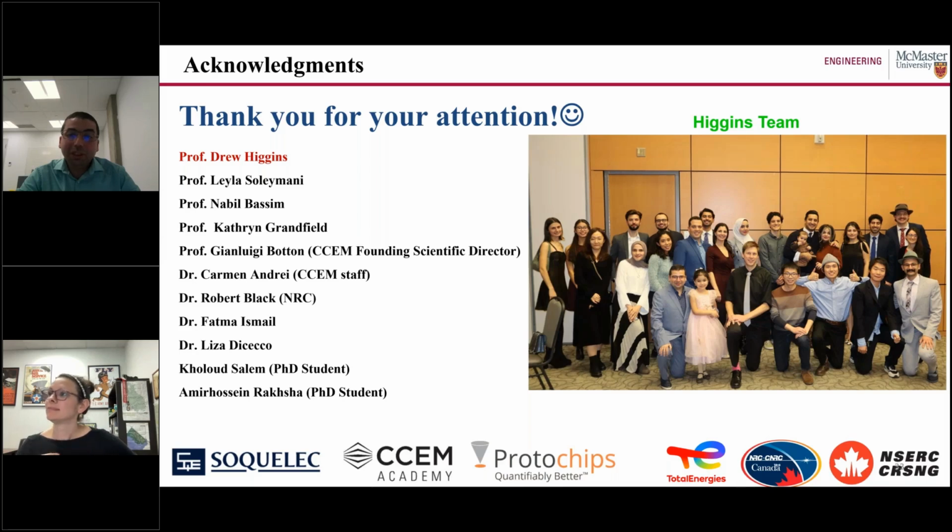The first main reason is just to keep our solution saturated with carbon dioxide all the time during this measurement, because the solubility of carbon dioxide is very low in aqueous solution. And the second reason is that by optimizing this delta P between these two silicon nitride windows, you can reduce the bulging effect under the vacuum, so you can increase the resolution. So for instance, you can just use the cross configuration, and also you can adjust the pressure, so you can reduce this bulging effect.